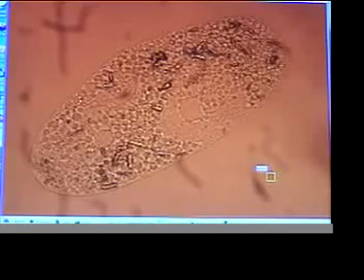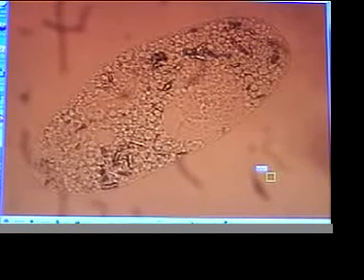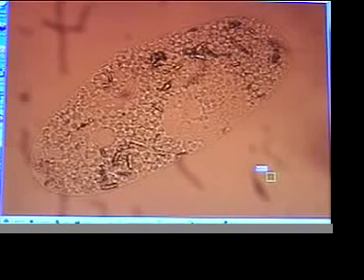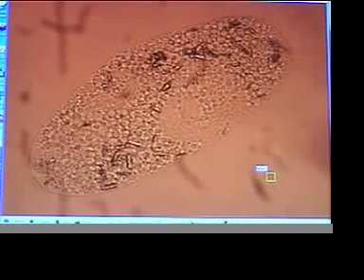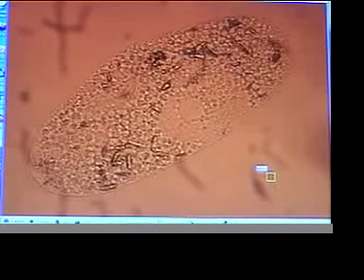Now we're seeing some changes. We're going to watch him carefully. I have a feeling something dramatic will happen. Certainly seems to be changing internally. And you can see that. Sudden destruction. It looks like the contractile vacuole no longer functions.